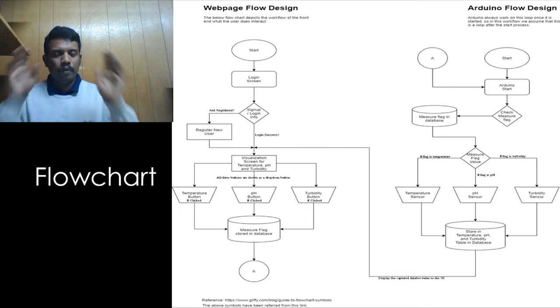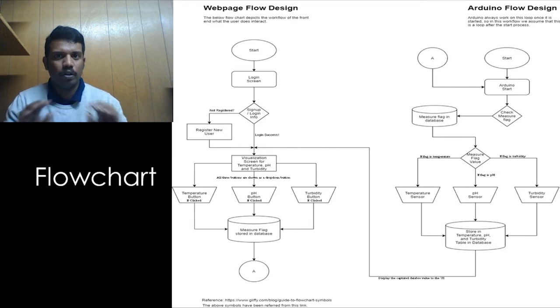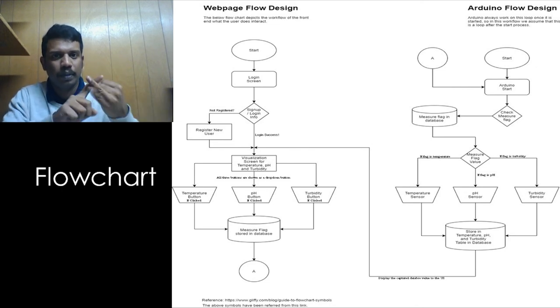So on the web flow design, it starts with the browser. You go to a user browser and then you get to see the login screen. You type in your username and password and click login. You get to see the dashboard where there will be a drop-down option with temperature, pH and turbidity options. And then a measure button. On the right side, you will see a graphical representation.